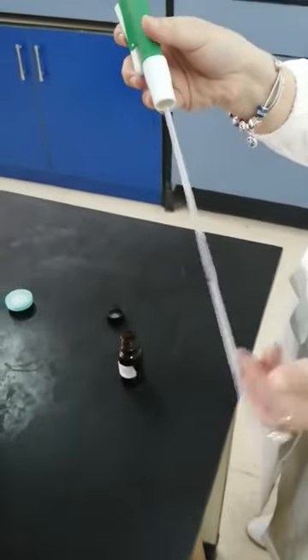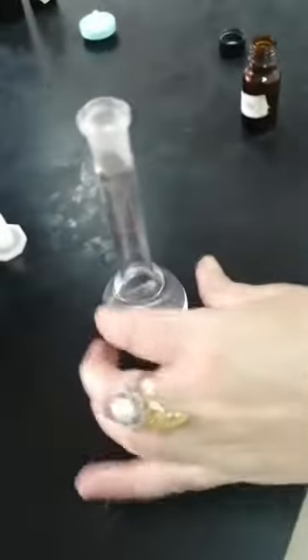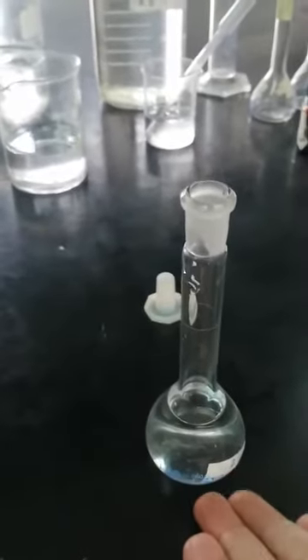I have to dilute it 50 times using a 1 ml volumetric pipette, and I will add it to a volumetric flask which contains a lot of phosphate buffer.